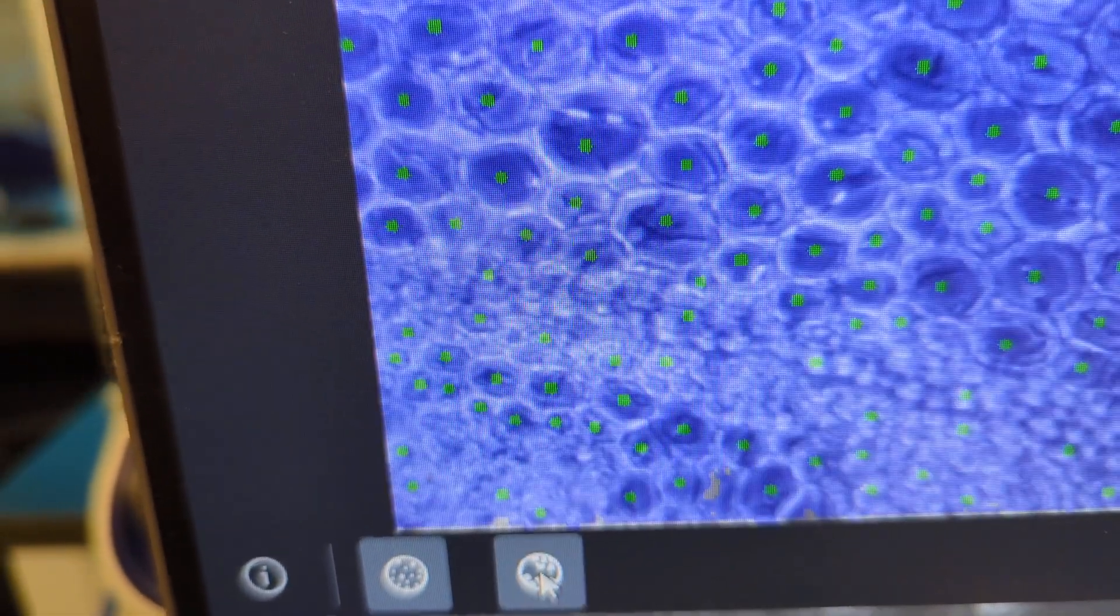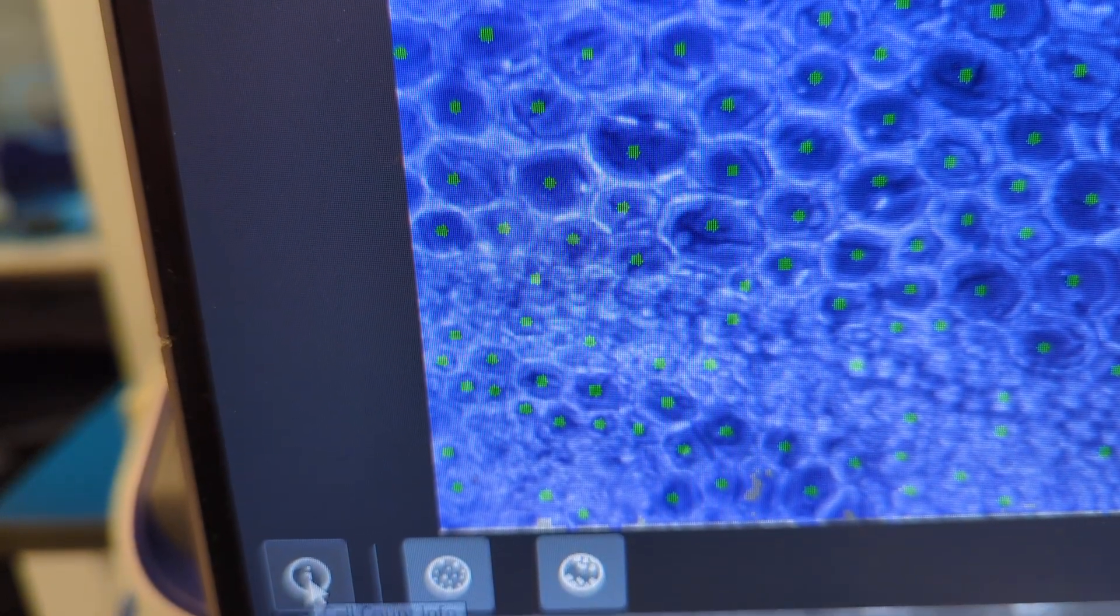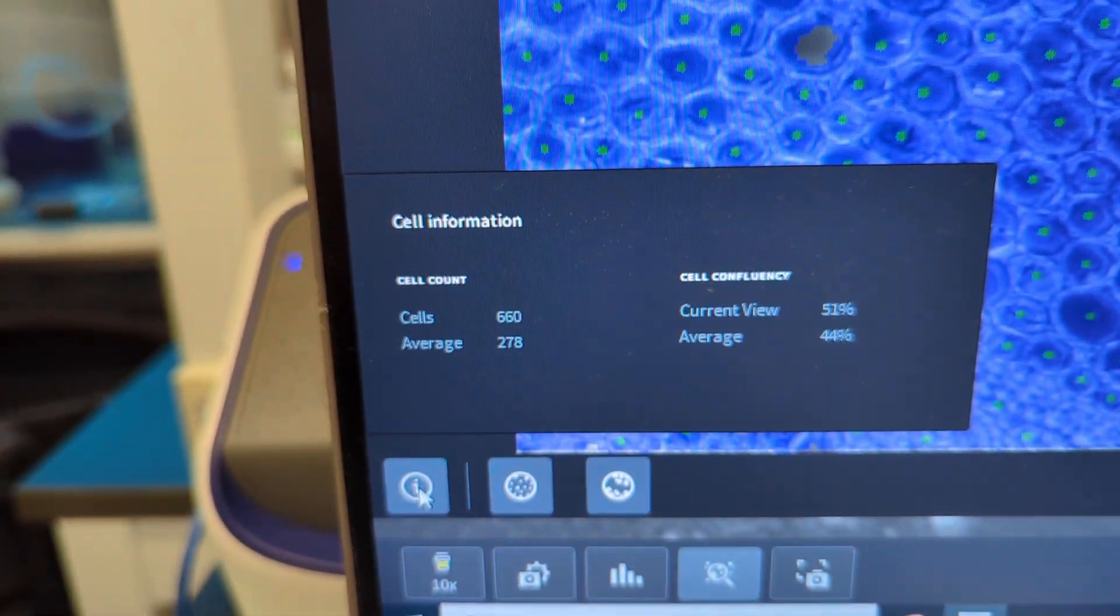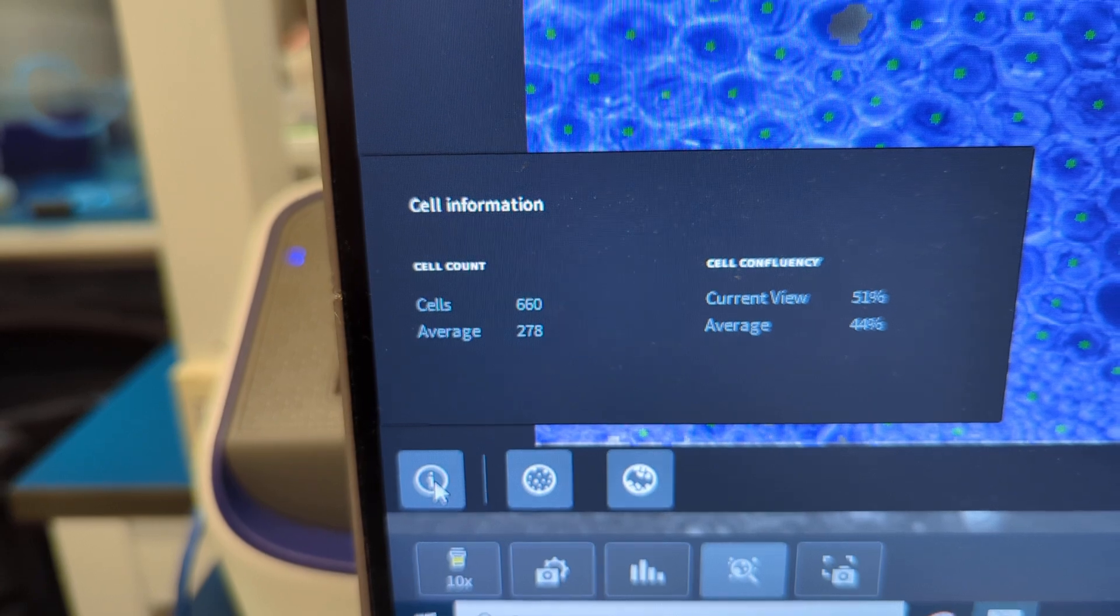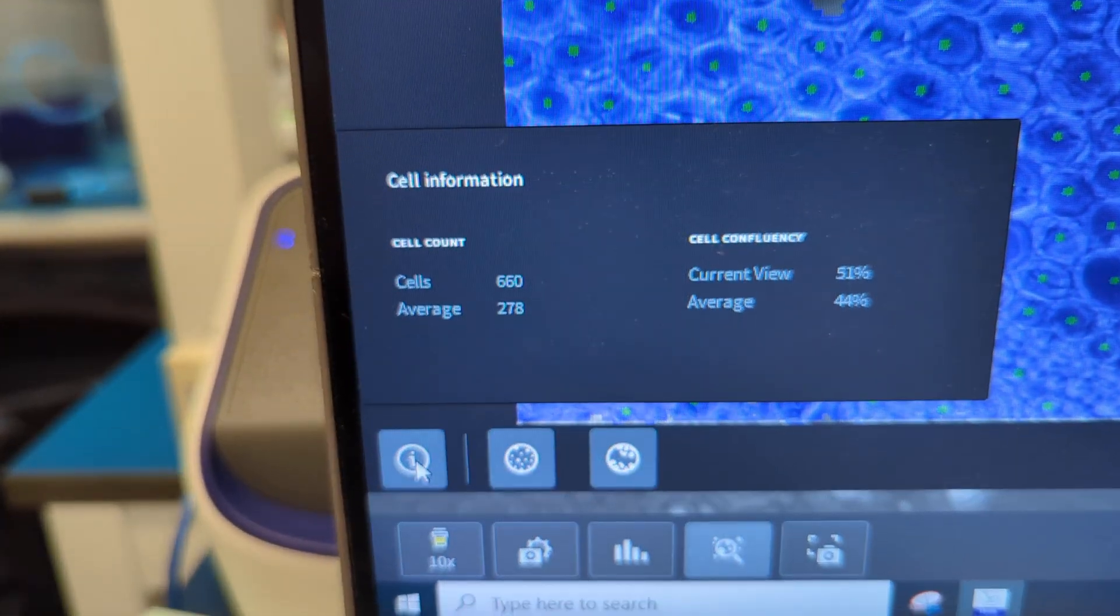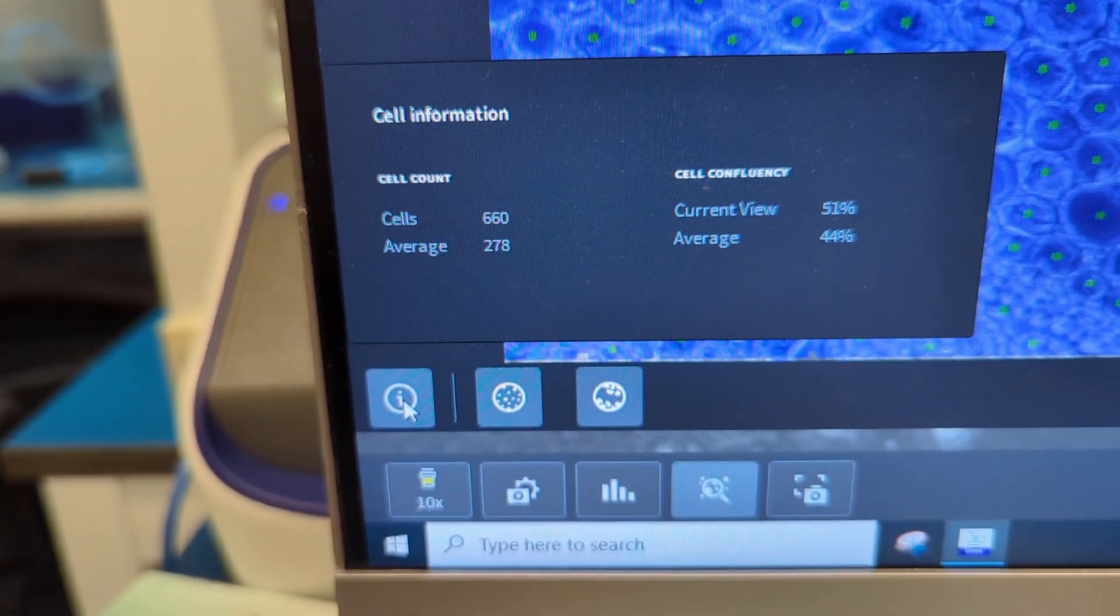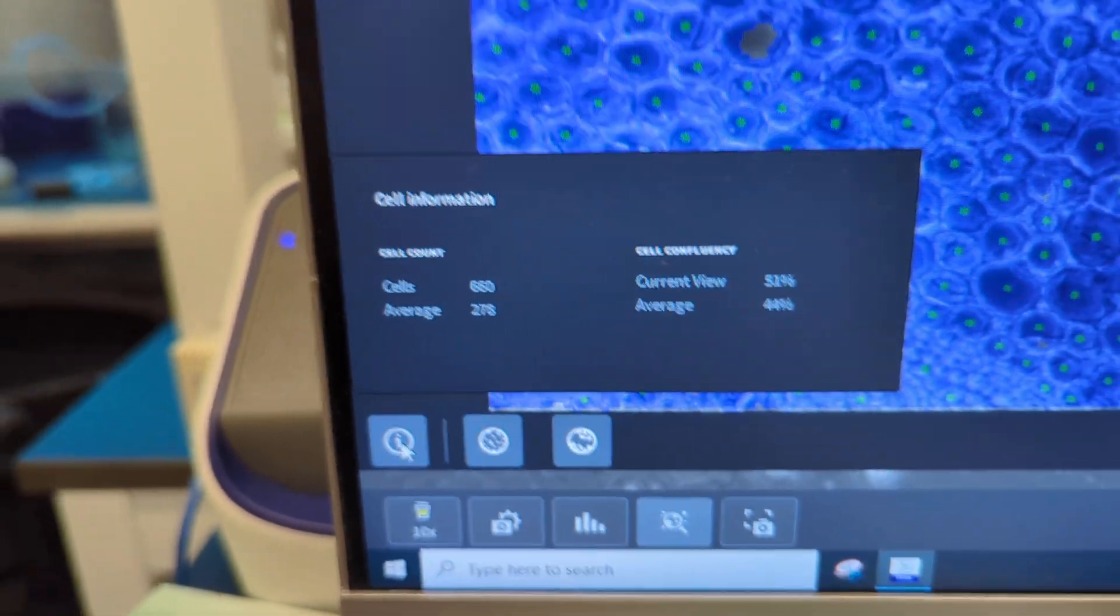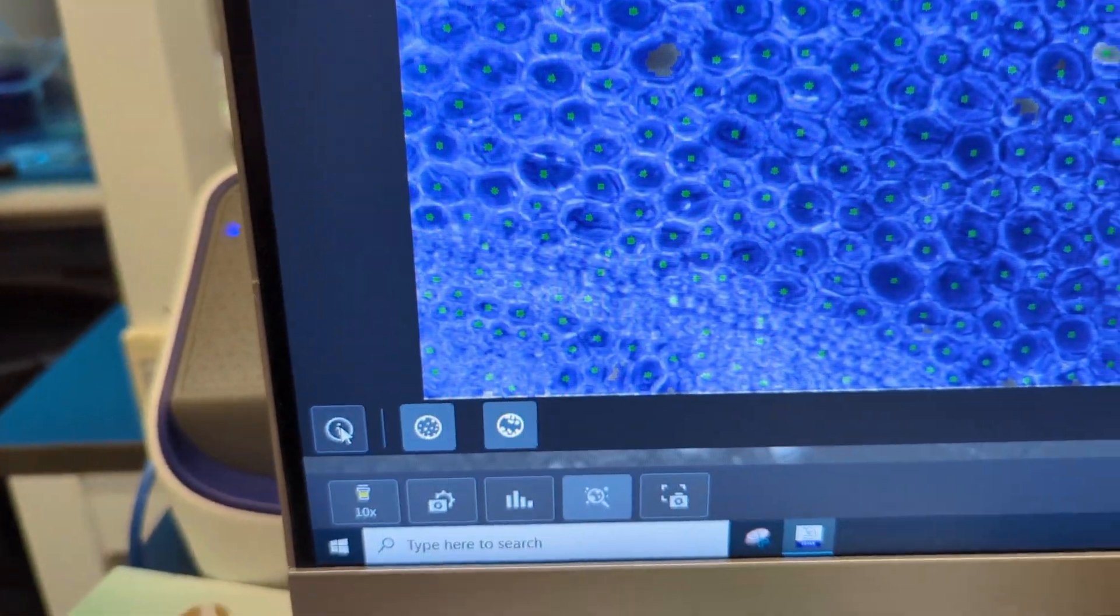And then, of course, you can have the info button, gives you a quick pop-up of your average for all scenes, and the current view. So that's just another quick way to do it.